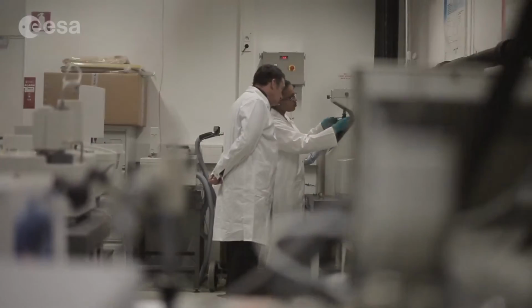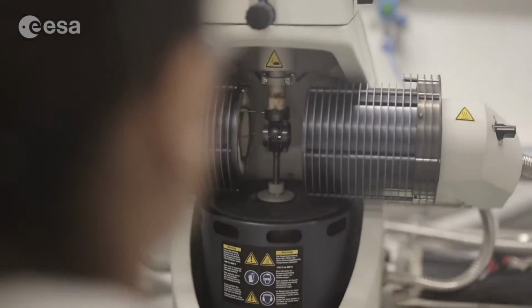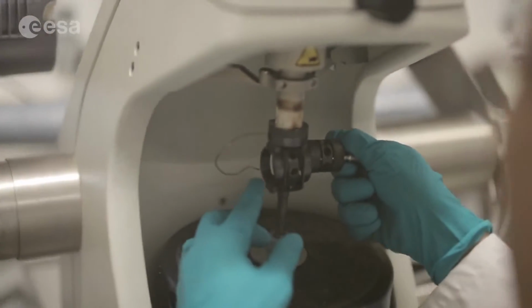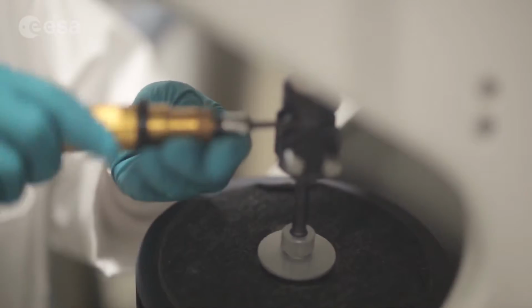Thermal analysis is a way of looking at the material's response to a range of temperatures. And often we have to use more than one technique to understand this. DMA is dynamic mechanical analysis, and it looks at how a material responds to a dynamic environment, i.e. we apply a load and look at the mechanical response of that material.